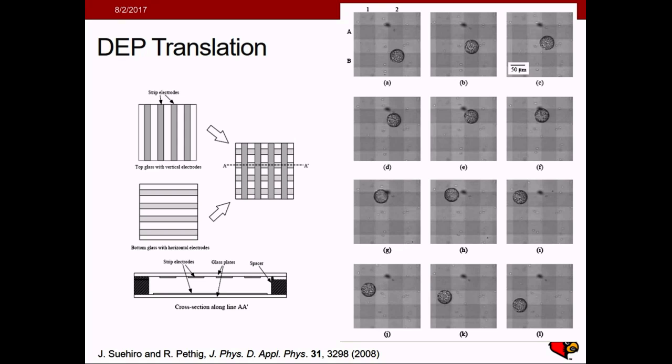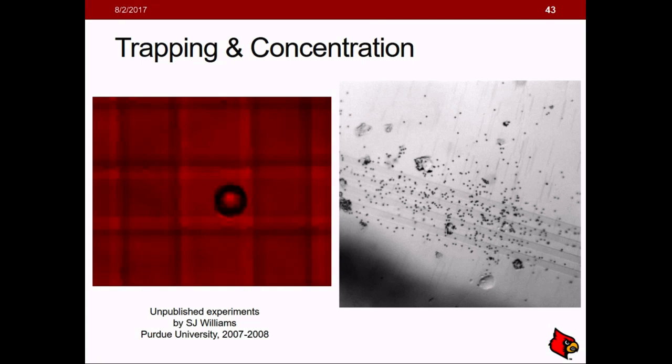I used this for my earlier graduate studies and was able to manipulate a particle to different electrodes, and then also playing with trapping on the right: particles that are continually being flowed, concentrated, released at different time points for trapping, manipulating one particle, many particles, controlled release, controlled direction, using dielectrophoresis.